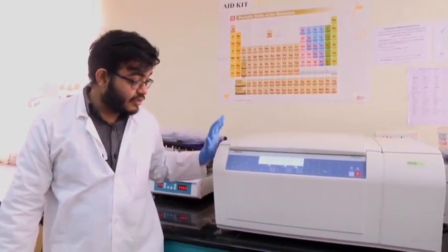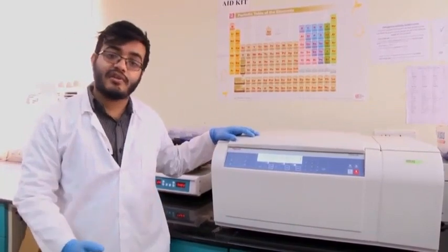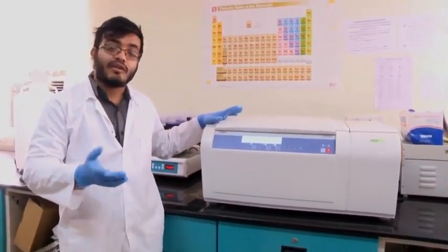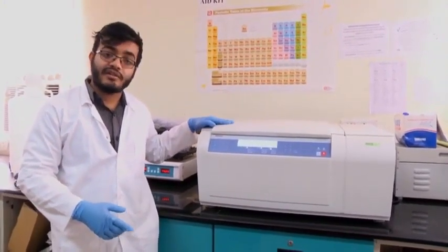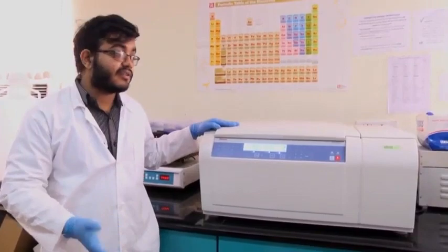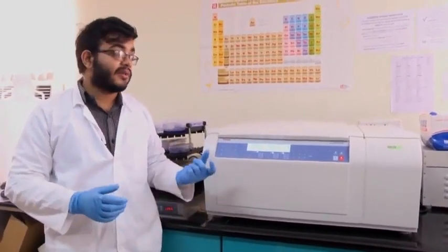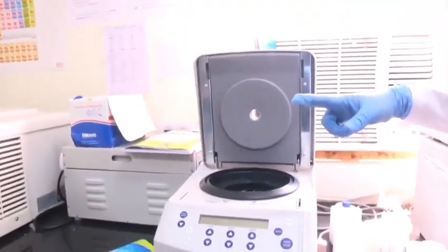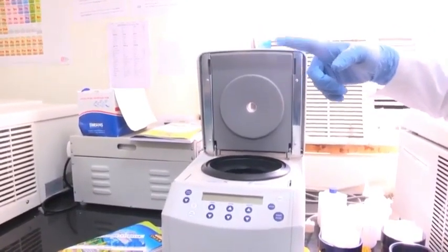And so this is just one sort of centrifuge. As we will be showing you, there are different types of centrifuges, and the principle of centrifugation remains the same. The only difference is some of them, like this one, might be refrigerated, some might not be. Some of them can handle larger sample volumes, some of them can handle very small sample volumes, and so on. So the earlier centrifuge that I showed you had a swing out bucket. I could not show it to you because the machine was running.